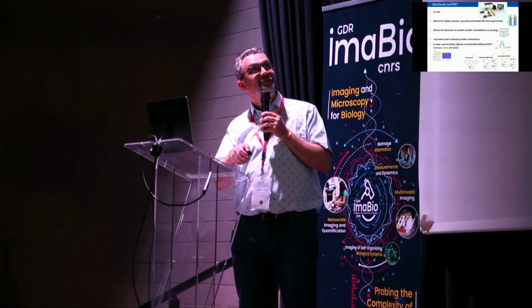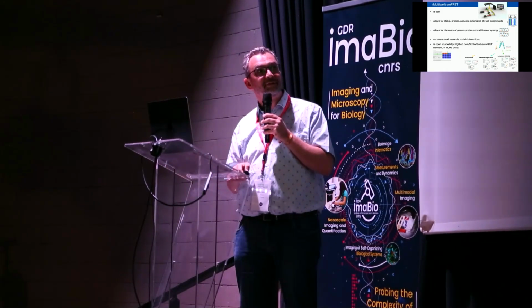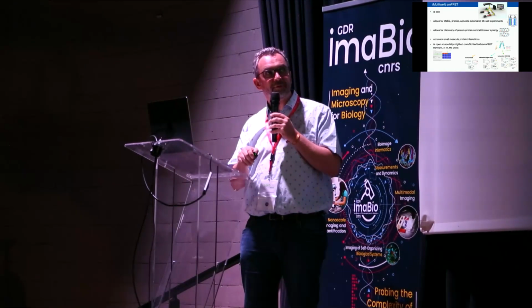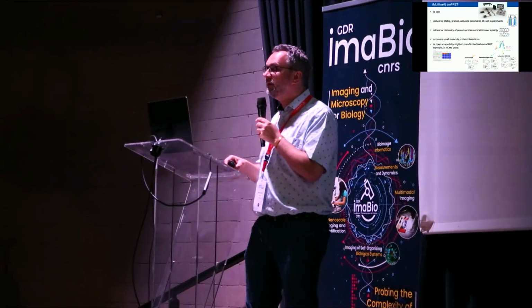I hope that I convinced you that FRET, and especially multi-well FRET, is pretty cool. We achieved a few different things. The software is completely open source, so you can download everything if you're interested in implementing it in your lab.